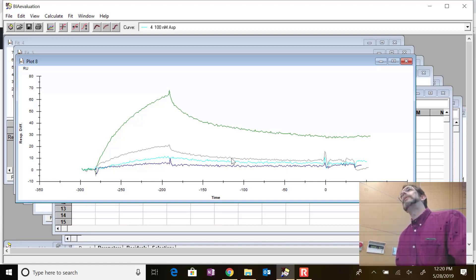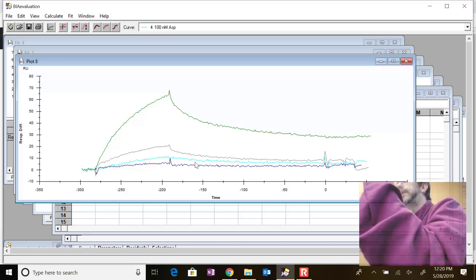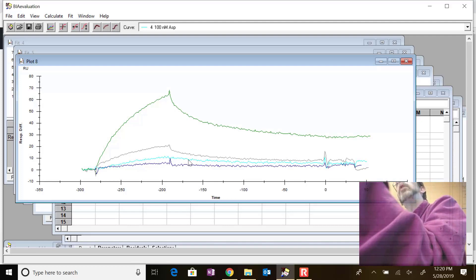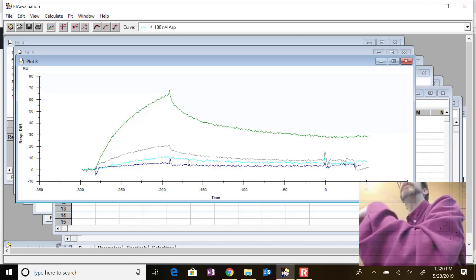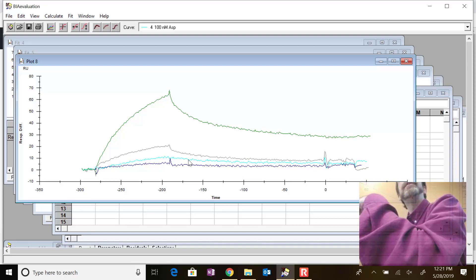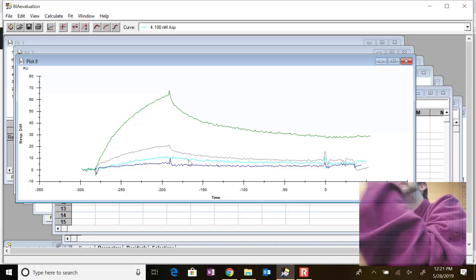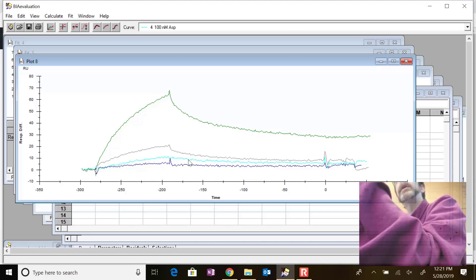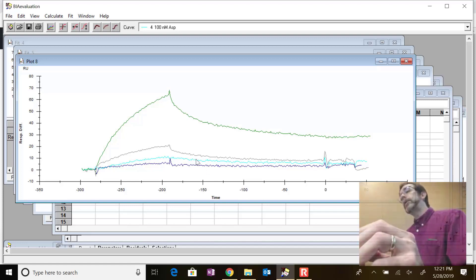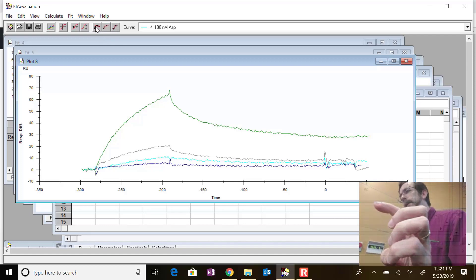If you have a curve going up at all, you can go ahead and get rid of it. You can also do something unusual: if the dissociation phase is giving you trouble, you can open that curve individually and delete - control-X - the entire dissociation phase. Sometimes that gives you an error and sometimes it doesn't. The association phase actually contains the dissociation kinetics because that reaction is still going on, so it might be valid to keep just that half if the other part is giving you trouble.